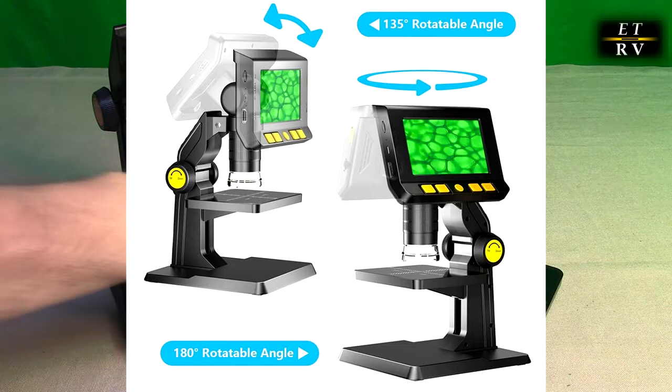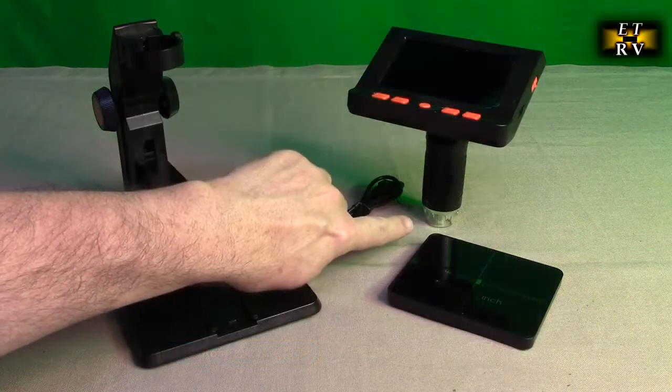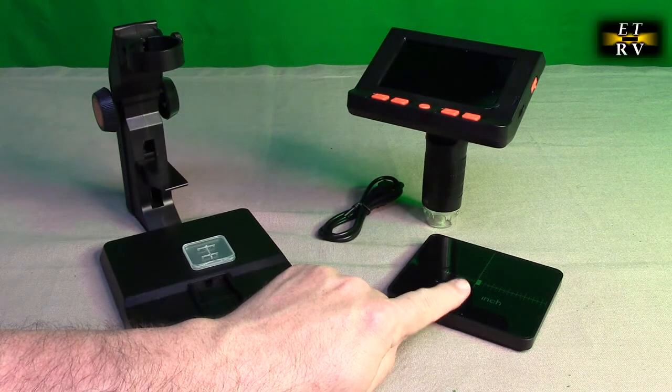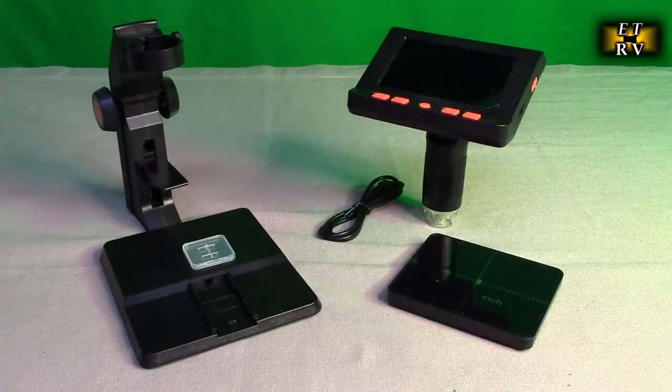It has eight LED lights in the little chamber right there. They're going to help illuminate anything you put on this little platter right there.